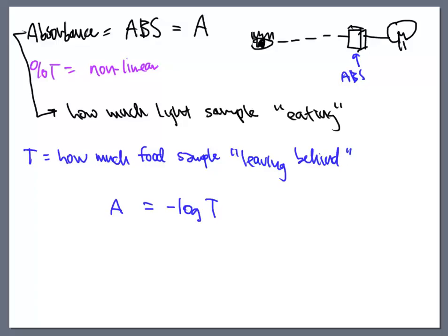And then we would convert all of the transmittance numbers into absorbance numbers. And then we would do our data analysis with absorbance. So we needed a calculator to do these problems. However, nowadays, in a laboratory, we don't have to do that. What happens now is that there is a setting.